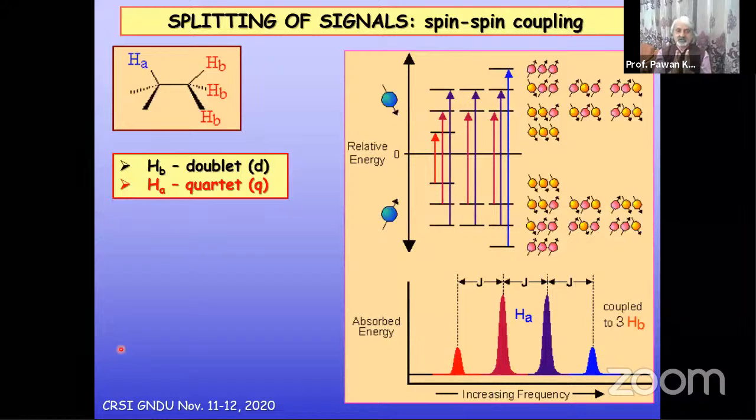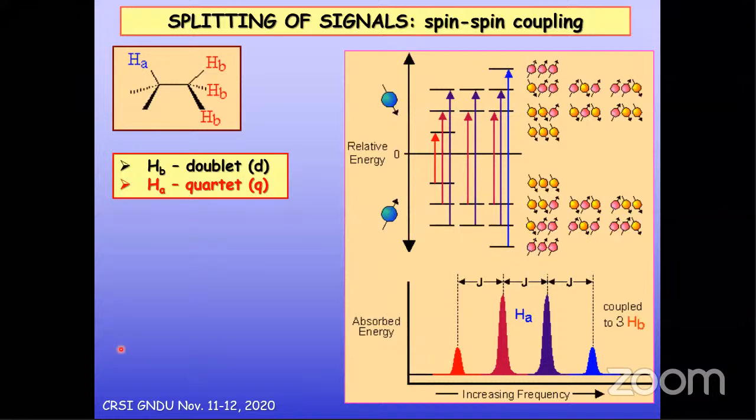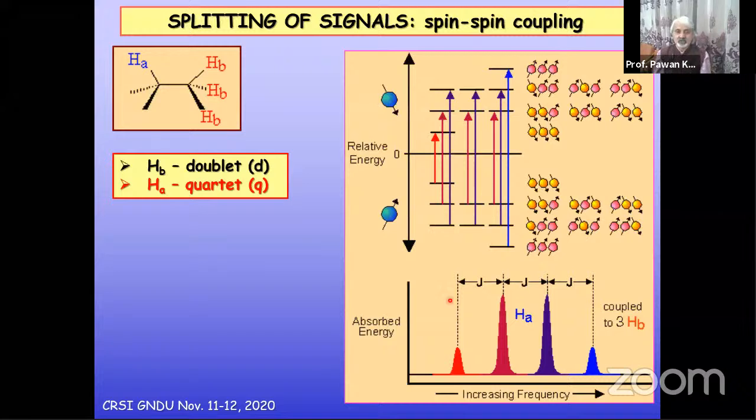So that will be, now you see 1 aligned, 1 opposed are cancelling each other. So 1 aligned is the net effect. So that would be de-shielding. So we have a strongly de-shielded signal. We have a de-shielded signal. That means less de-shielded as compared to the strongly de-shielded. Similarly, there is another possibility where instead of all 3 opposed, we have 2 opposed, 1 aligned. And this also has 3 possibilities. So we can have again 1 and 1, 1 aligned, 1 opposed get cancelled. So we'll have a shielding. So we have strongly de-shielded, de-shielded, shielded, and strongly shielded.